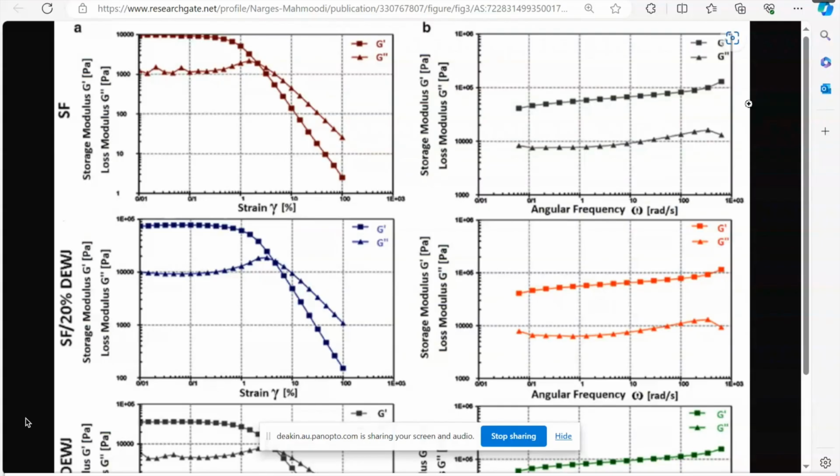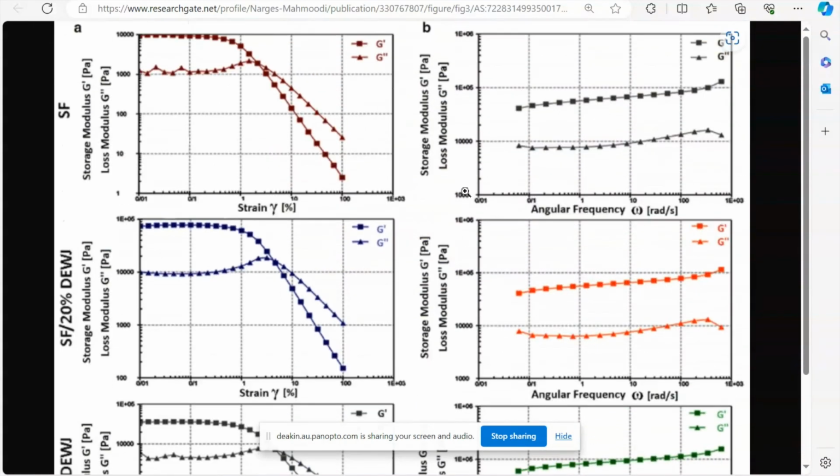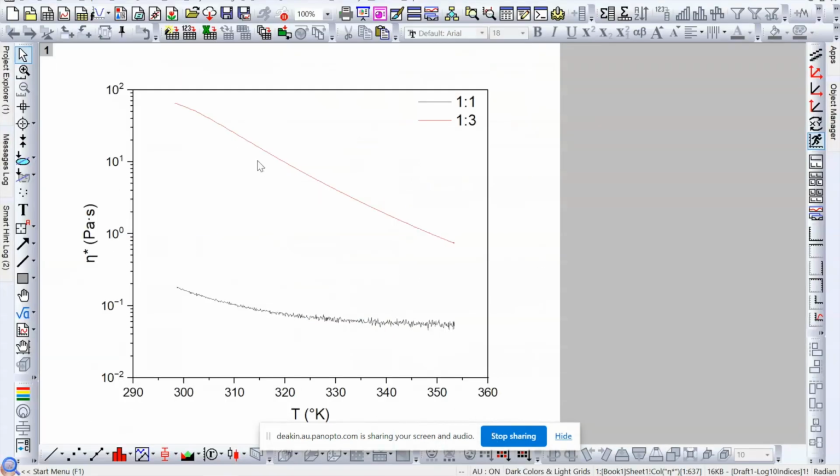This video is about Origin graphing software and how to set the y-axis to a log10 scale, and then how to set that to either the E notation or 10 to the power of notation, as you might be required to with different scientific papers. This is very useful for rheological data, which varies over large scales, and commonly you have to report it with a log10 base scale for research papers.